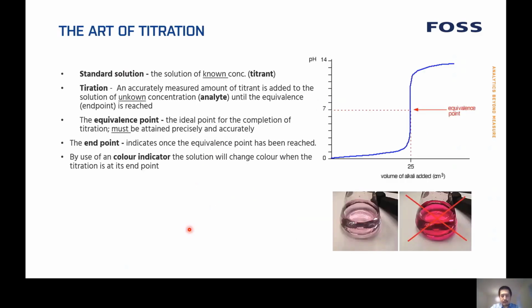Usually this is a colorimetric method, so the principle is that in this receiving solution there's an indicator which shows a color change based on the pH value. There's an equivalence point where, when some titrant is added, there's a steep change from low pH to high, or from high to low. And the principle here is usually an acid-base equivalence change at pH 7.